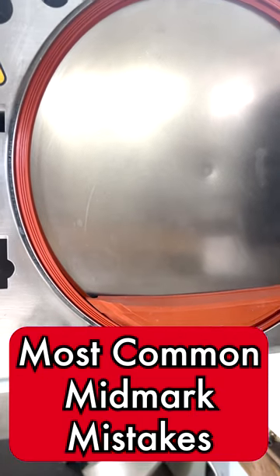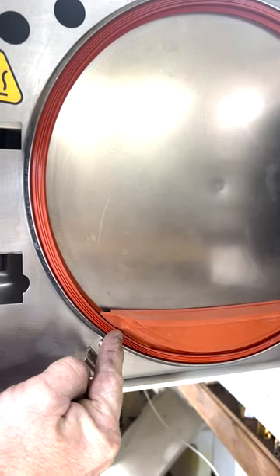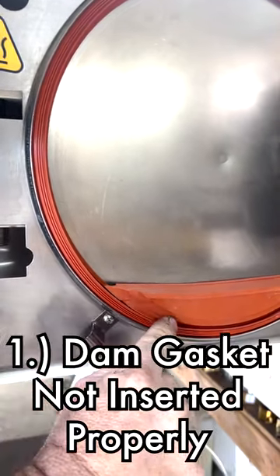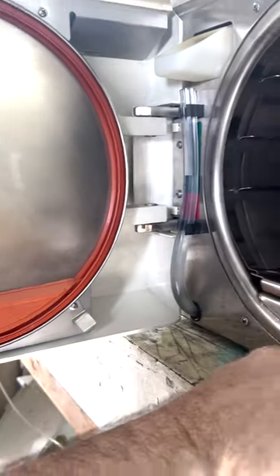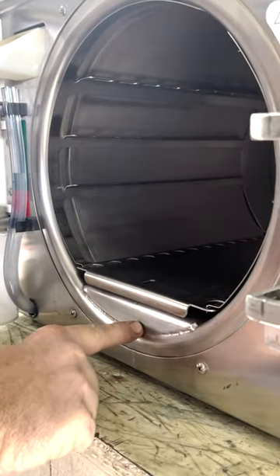Now, this will cause overheating, and this is all it takes. See where that's partially out of its groove? You're going to make sure that it's fully inside of its groove. Sometimes, when you have a dirty face right here, it will stick.